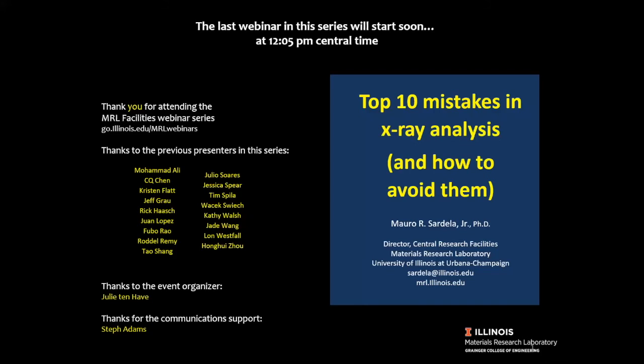Thanks, everyone. Over the past 2 or 3 decades, training users and researchers in the field of X-ray analysis and doing research in that area, we have identified some common mistakes or problems that people run into when they do the analysis using this technique. So I put together a top 10 list of those.